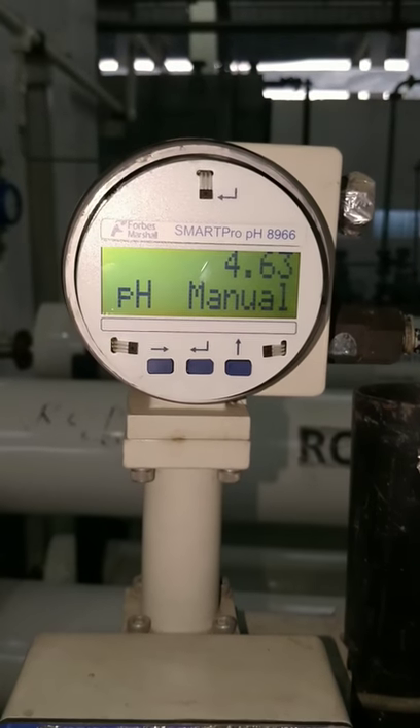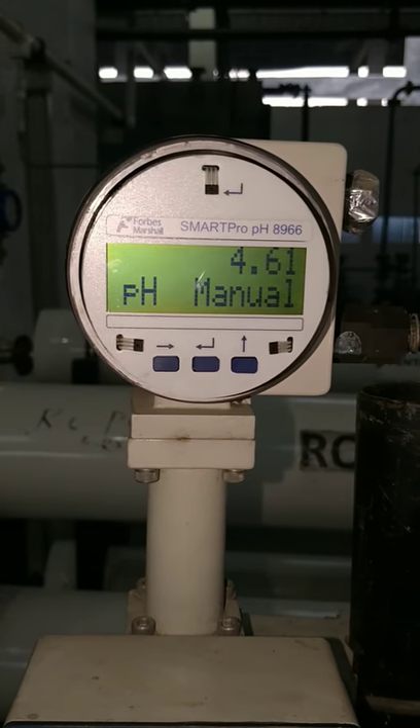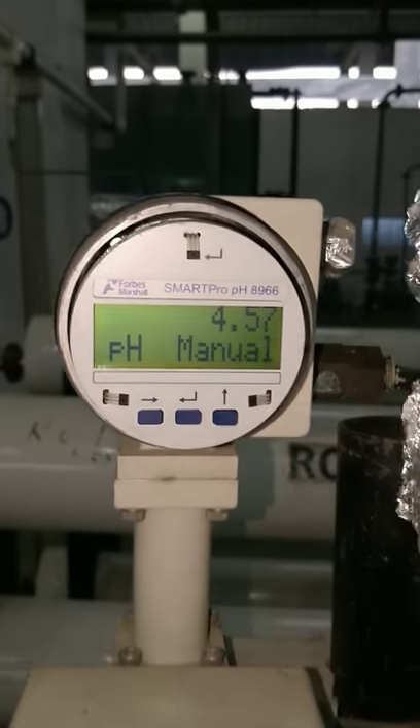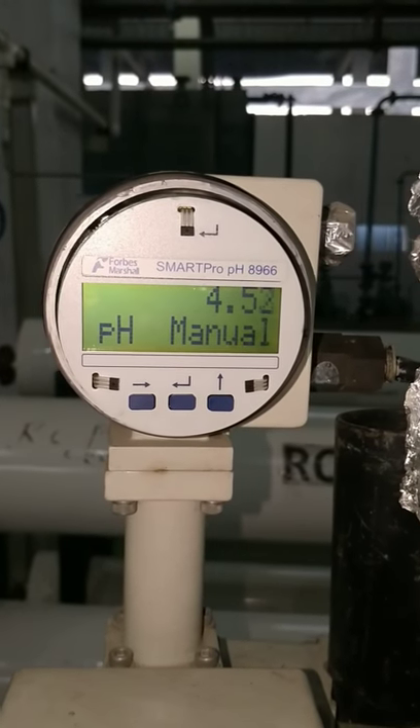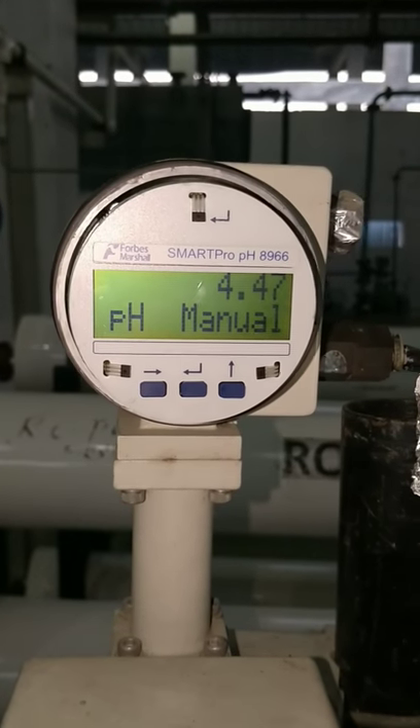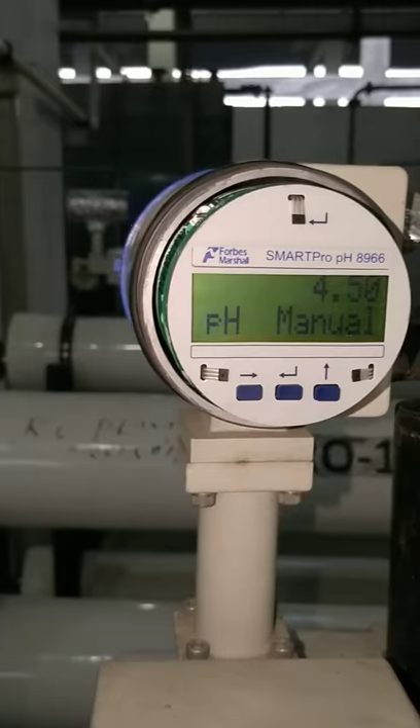In this video, we will see calibration of smart probe PH8966 PH transmitter. For the calibration, you must be ready with three PH buffer solutions, at least two. Now, I will explain the procedure for that.